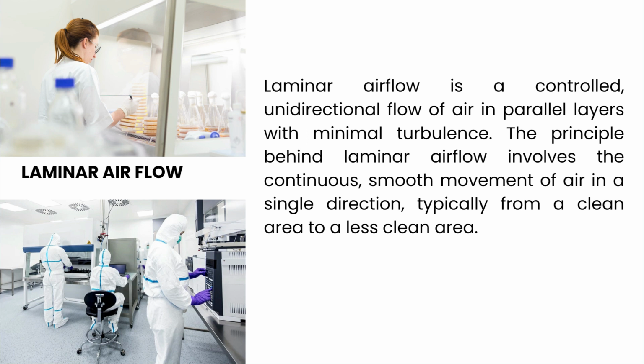The laminar airflow is equipped with a HEPA filter, and this HEPA filter purifies the air and circulates the air within this laminar airflow, and this results in maintaining hygienic or sterile conditions.